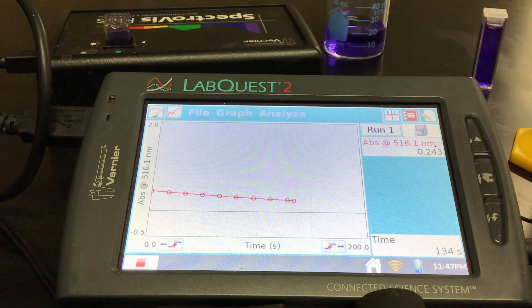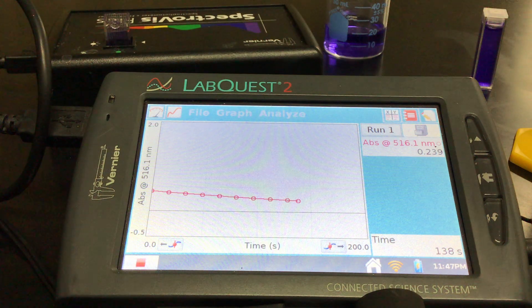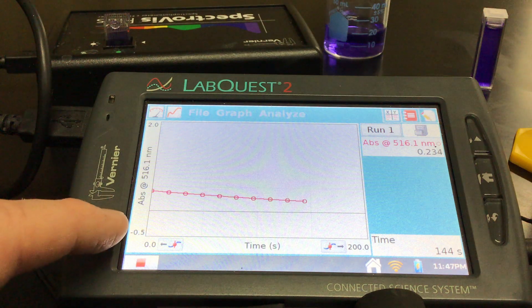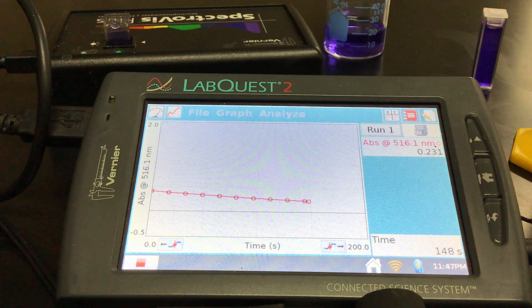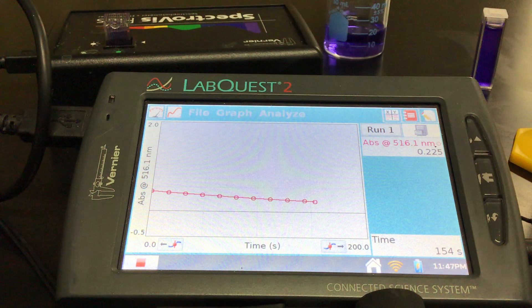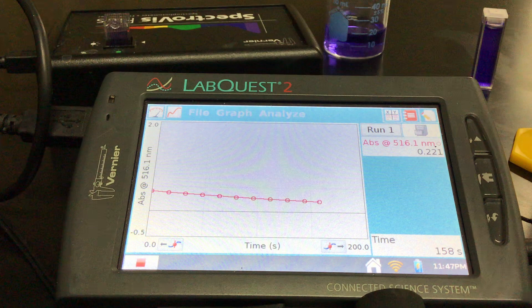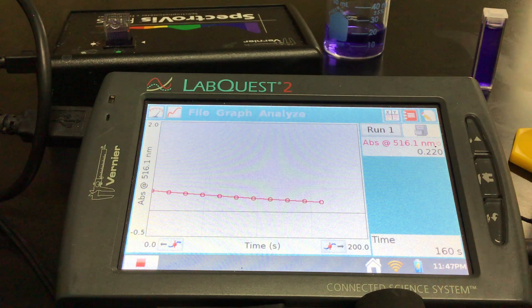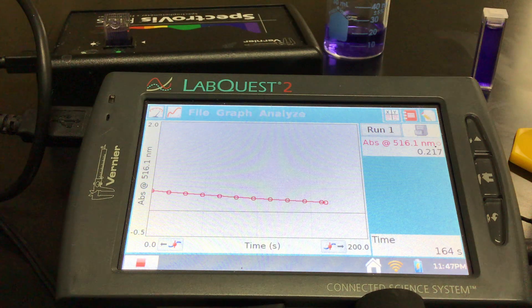As we look at the graph here, it's a little bit hard to tell. It looks pretty linear, but again the scale is so big it's really hard to tell. The axis down here is at negative 0.5 which is really going to skew our data. If our data is what we hope it to be, we should really be able to tell if there is a slight curve to it or whether it's a straight line linear relationship going down.